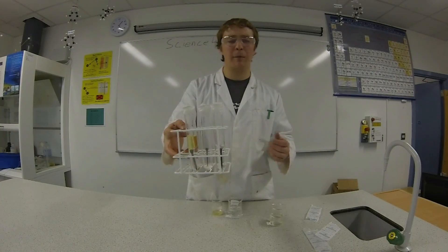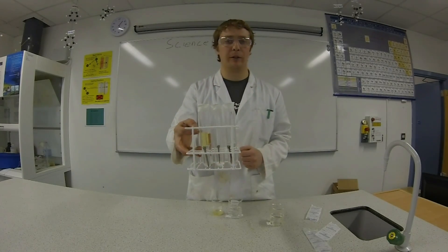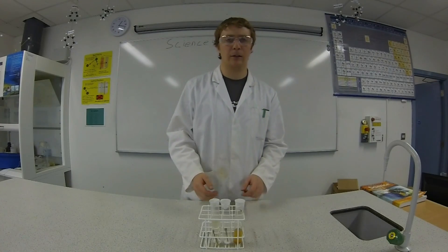There's our three test tubes. We'll come back in about a week and see if any rust has formed. So here we are a week later — let's take a look at the results.